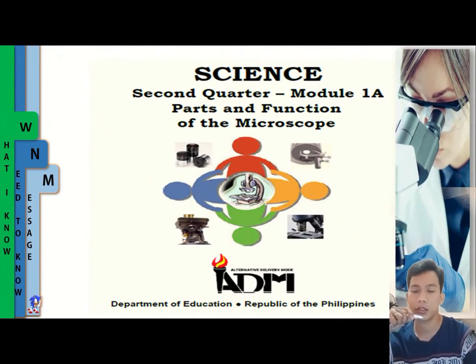Welcome to the second quarter of the school year 2020 to 2021. For the second quarter, we are going to discuss Module 1A, parts and function of the microscope.